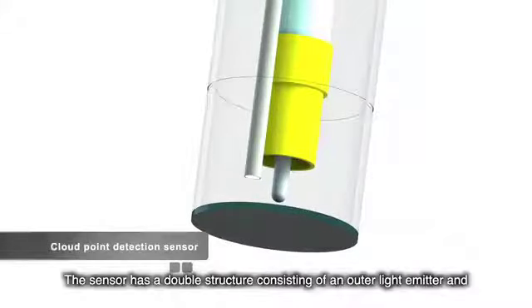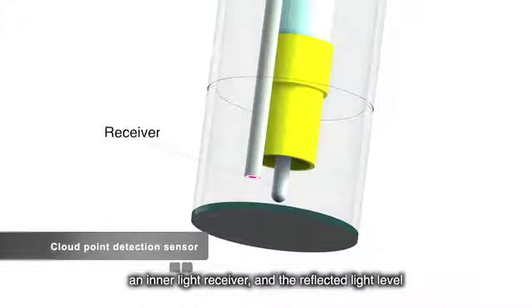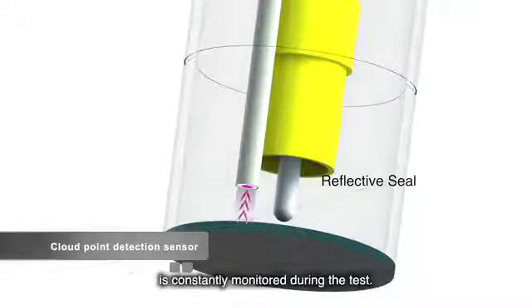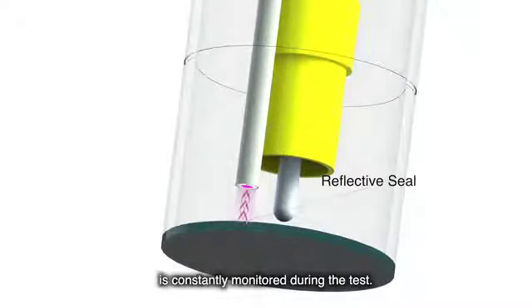The sensor has a double structure consisting of an outer light emitter and an inner light receiver, and the reflected light level is constantly monitored during the test.